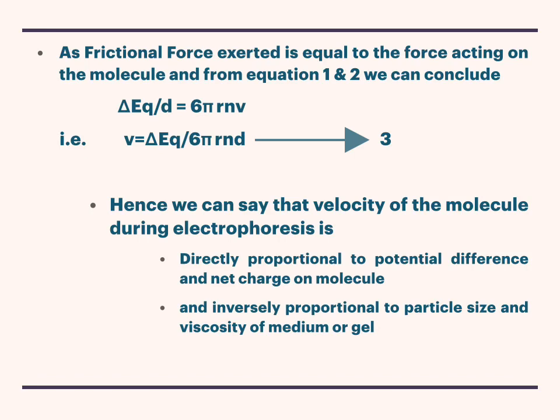Thus, we now equate equation 1 and equation 2 and get equation 3, which gives the velocity with which a charged molecule migrates within the medium under the influence of an electric field.